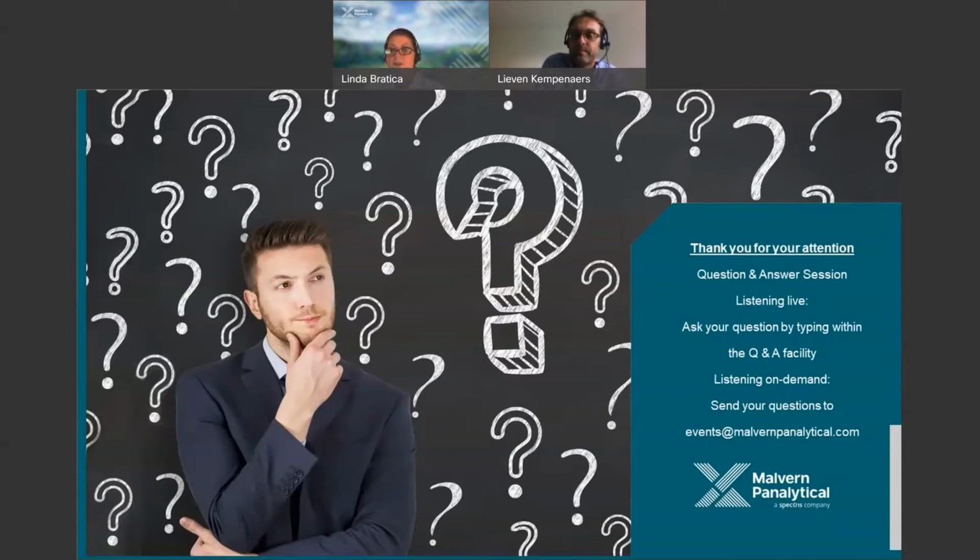Okay, next question. What does tube flash indicate? Oh, that's a very technical question.